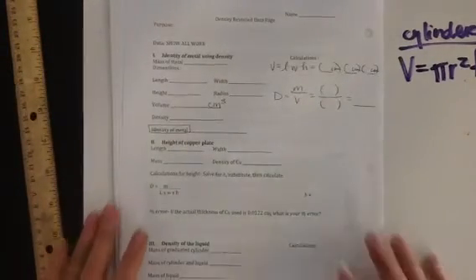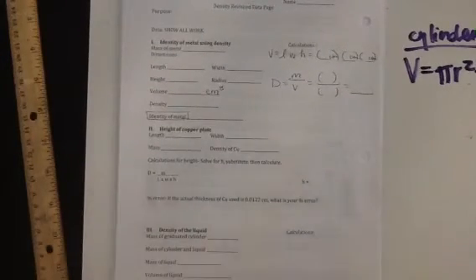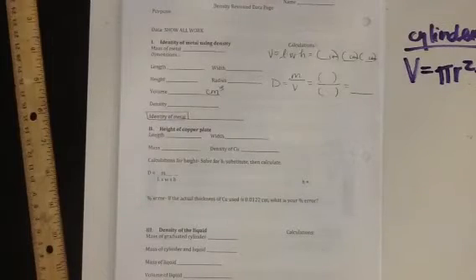The second part of the lab, I'm giving you a copper plate. So what element do you have? We're just going to look up the density of copper. So you'll look on the periodic table, what is the density of copper? And my question for you is, what is its thickness? So this is the copper plate. There's one at every lab station. And so you're going to need to use your math skills to work with the equation to solve for how wide it is, its thickness, okay?